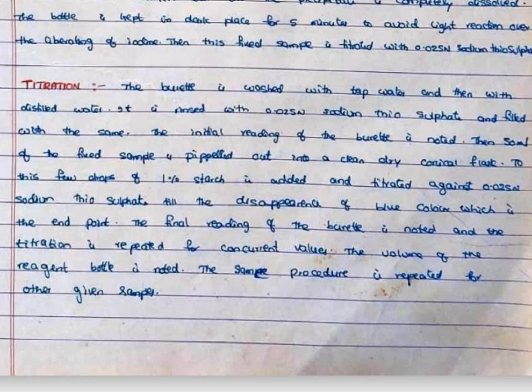The volume of the reagent bottle is noted. The same procedure is repeated for other given samples.